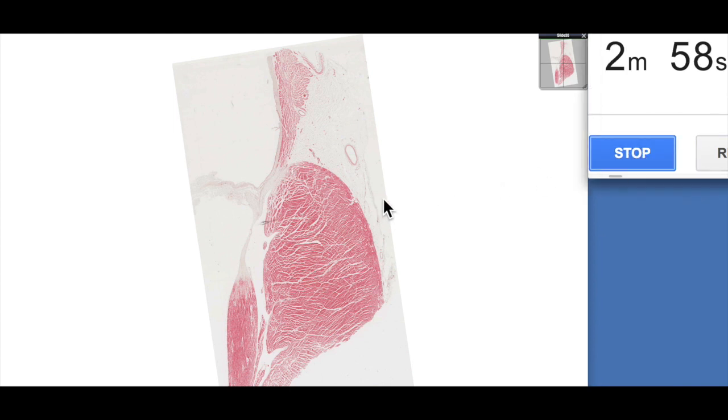This is a really nice section, the junction between the atrium and the ventricle here. This is actually the coronary sulcus or the atrioventricular groove. We can find adipose tissue here and the coronary vessels as well. Here's the atrium, you can see it's a much thinner wall compared to the underlying ventricle.